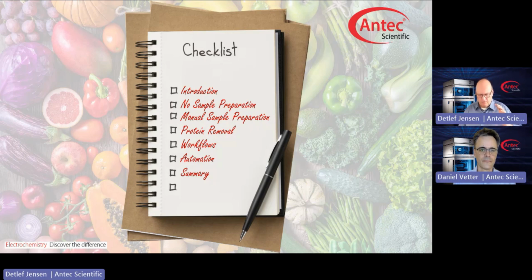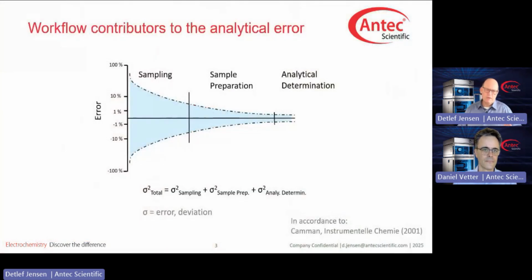Now let's jump right into the introduction. I brought this slide with me, this graph, because it shows that usually when we do analytical determinations and talk about analytical errors, we talk about the contribution of the analytical determination.